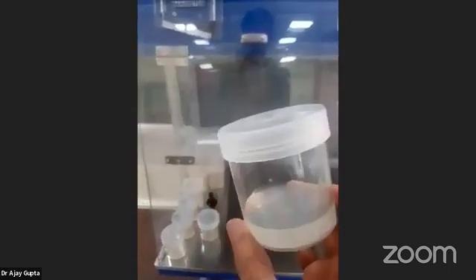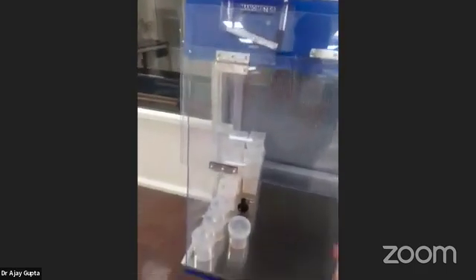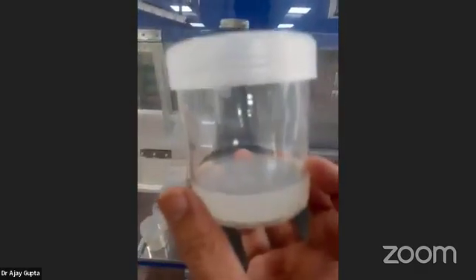So this way the media is now ready. First it was made in the media room, and this is a sterilized media. Now you can see there is no contamination; it was made, I think, one week back, so it's all still clear. This we have to ensure. Once the media is ready, it is stored for 4 to 5 days to check whether there is any contamination, and once that is done, then the real process is done here.